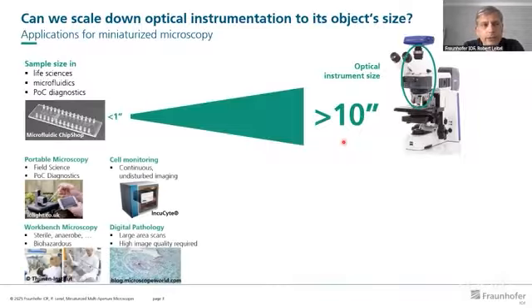And of course, you know, the applications where they are needed. For instance, the portable microscopy, also cell monitoring is one target application here. Also in workbenches where you are working in sterile, anaerobe, or biohazard environments, then you would be lucky to have not such an open system like here, but have a small and compact device, or also digital pathology, where you want to have at least large area scans to be detected.